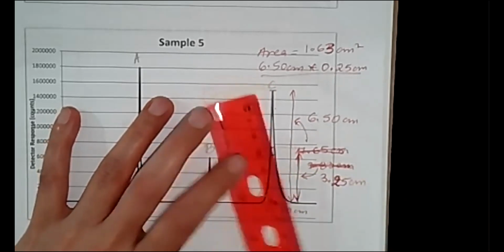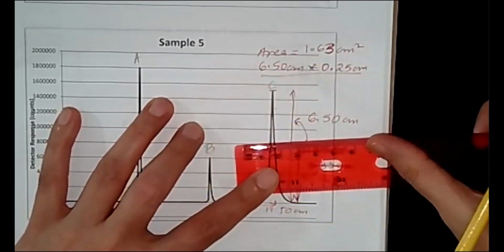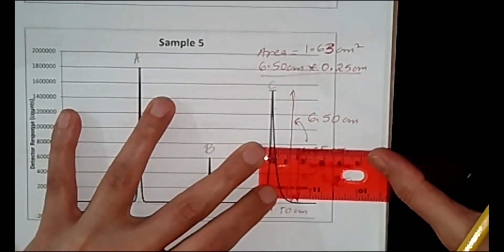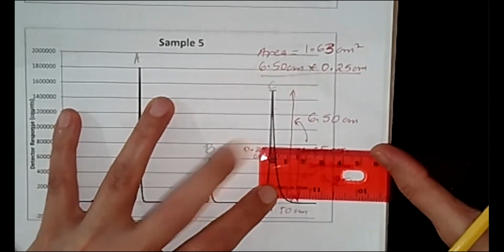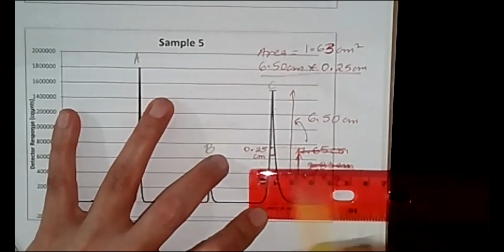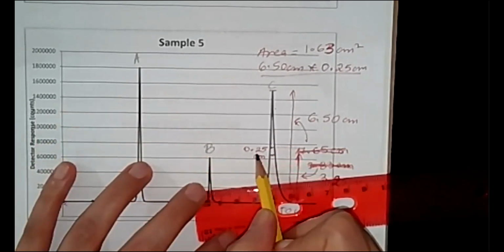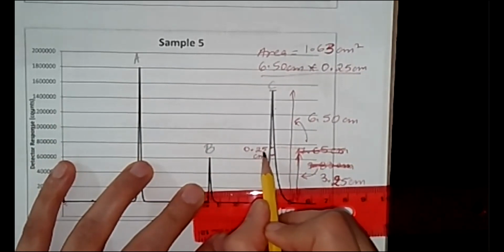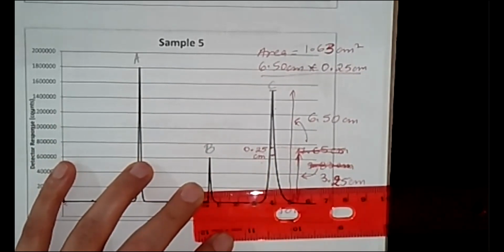I will now take my ruler and very carefully observe the width at half this height. Now, this may be a very small number, so you do not need to be alarmed. But since we are using a centimeter ruler, you need to be recording the appropriate numbers.